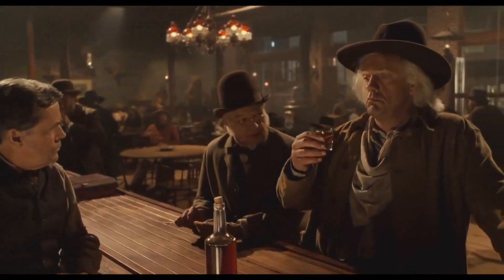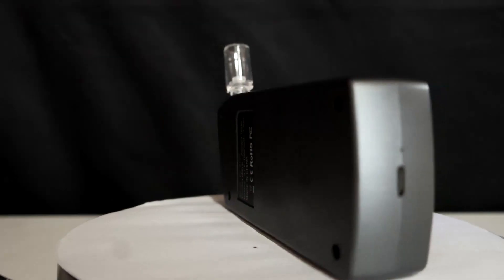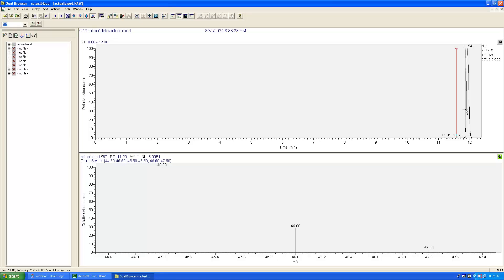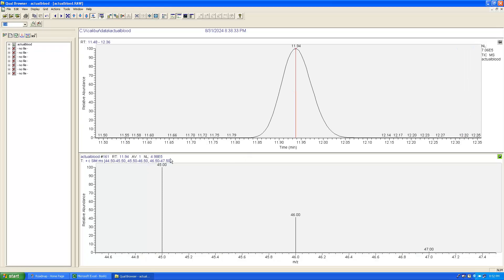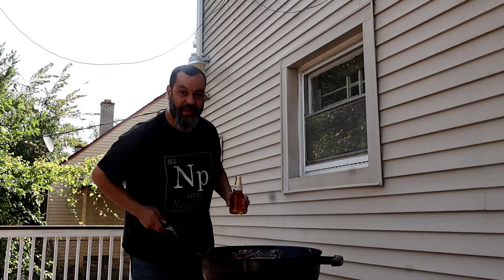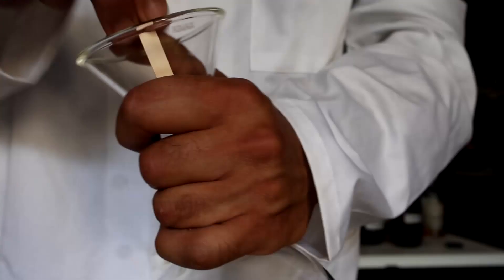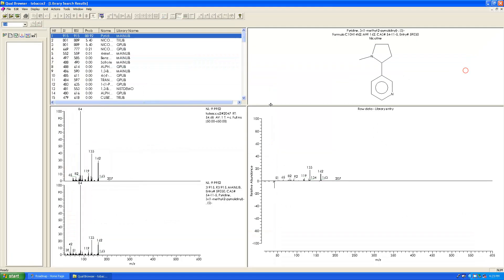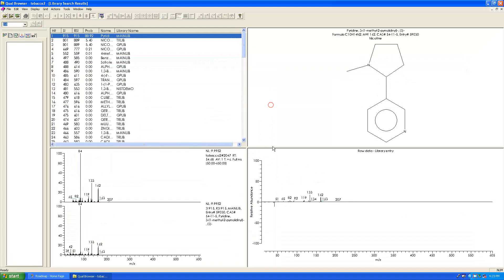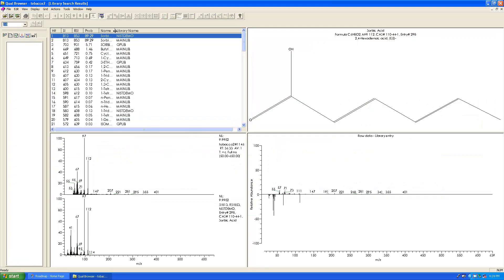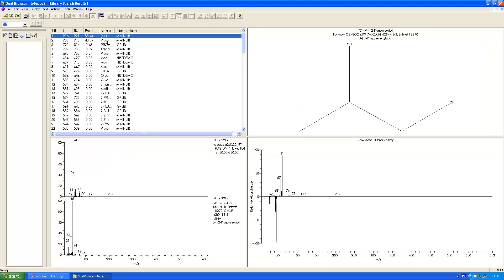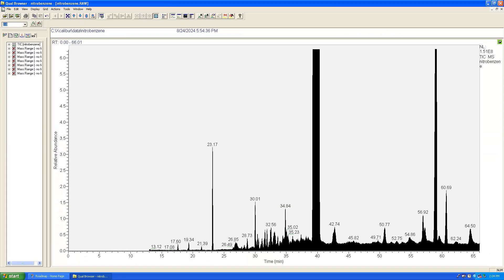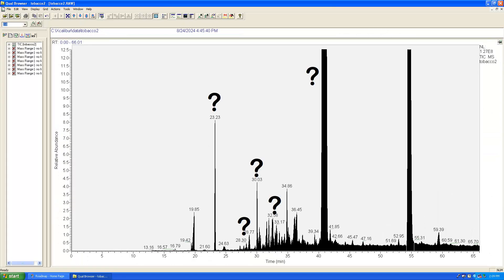Because everyone processes alcohol differently, these values only work for me at this point in time. It was fun and interesting, but I'm not sure how much I trust these cheap breathalyzers — there's probably a wide margin of error somewhere. I was just happy to see ethanol picked up by the GC-MS from my blood in quantities that make sense. Now since we're having a good time, let's take a quick look at tobacco. I used some of these leaves with the same DCM extraction as before and concentration. Nicotine is here — perfect. Some sorbic acid too, right here. And propylene glycol — both used extensively in the food industry. Same library limitation problem; many other chemicals I could not identify with certainty.